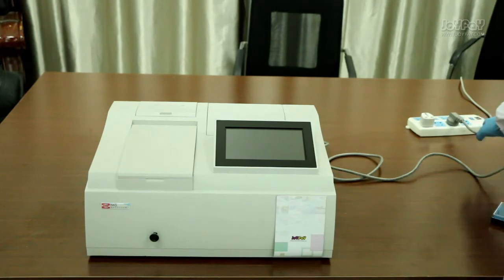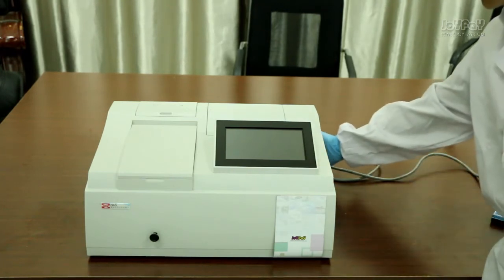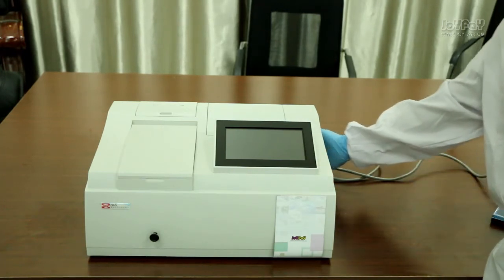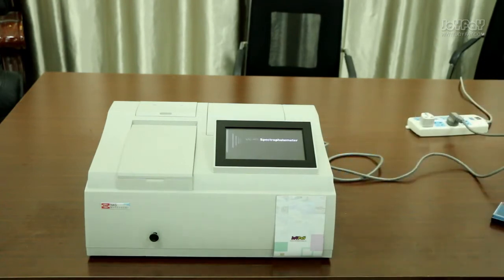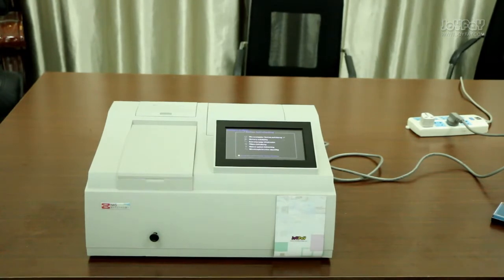Connect the machine to the power and turn on the machine by pressing the power button at the back. You can see the machine is in self-checking. Please do not open the sample chamber when initializing.